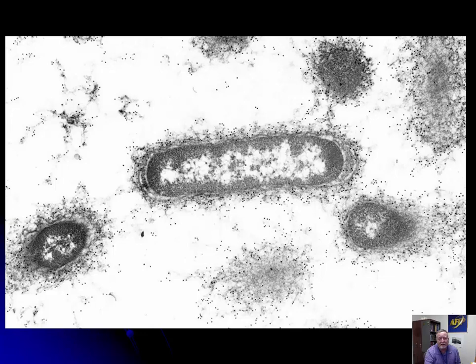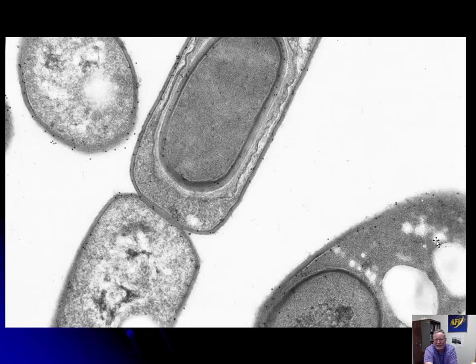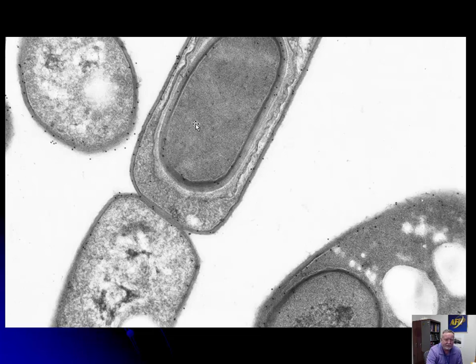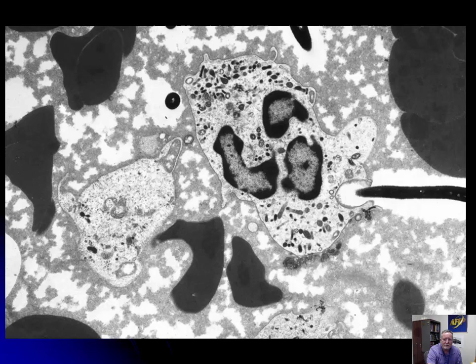Just to remind you — not much you can tell with bacteria. Thin cell wall, not very dense, oblong — this is actually E. coli, your gram-negative cells. One other thing you can actually see within a bacterium is the spore form — in spore-forming bacteria like Bacillus anthracis, you can see the spore. These are robust bacilli with spores, going into a particular subset of gram-positive bacteria that makes spores. I just love this last picture — this is a neutrophil appearing to smoke a cigar — actually engulfing anthrax bacillus. A fun way to end this particular section.